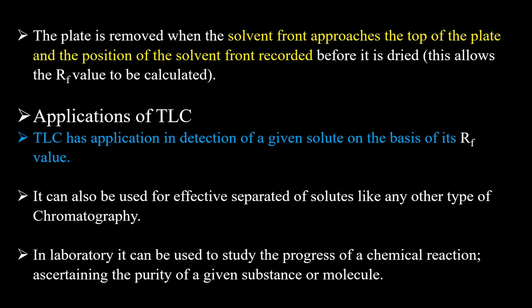Now we'll consider applications of TLC. That is the next point of the lecture. TLC has application in detection of a given solute on the basis of its RF value. Second, it can also be used for effective separation of solutes like other types of chromatography. Third, in the laboratory, it can be used to study the progress of chemical reactions and to ascertain the purity of a given substance or molecule.